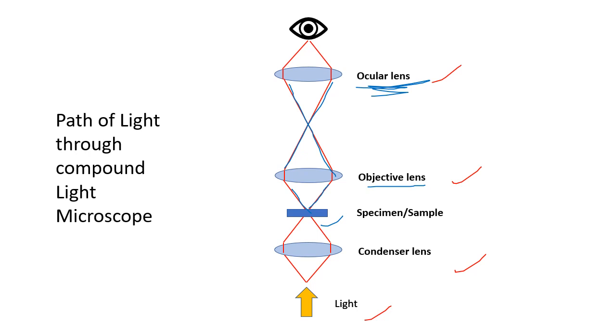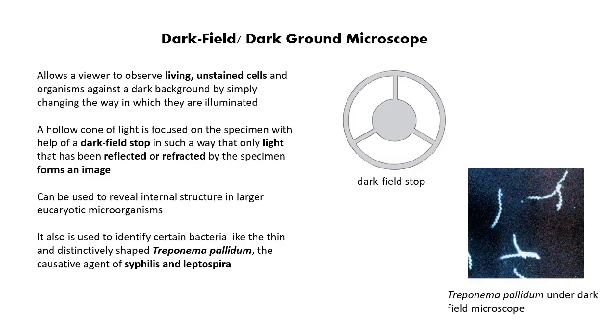So I hope this is helpful for you. Next thing is this is about the light microscope. Then I am coming to the dark field or dark ground microscope. As the name suggests, the image of this microscope has a dark background. You can see here also.